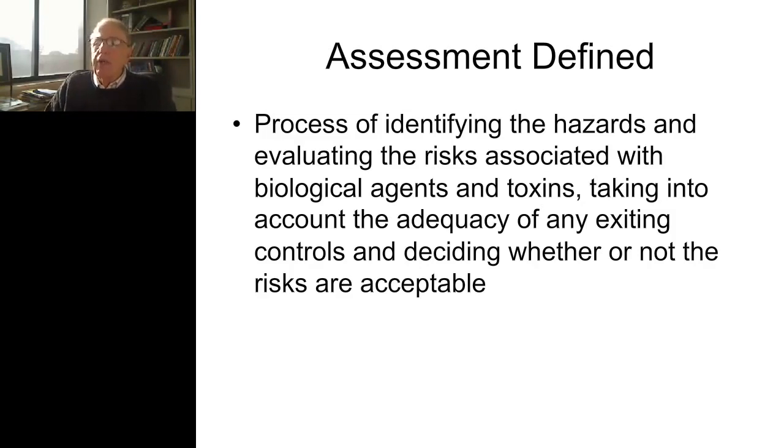Now, recognize that risks are never going to be zero when working in the laboratory. The work itself entails potential risk of exposure to pathogens. Even though we're taking many precautions that weren't in that 1950s picture that I showed you, there's still risk that exists. We can't bring it down to zero, but we can bring it to an acceptable level so that we can do the work that is required, that we are there to do for the benefit of the patient.